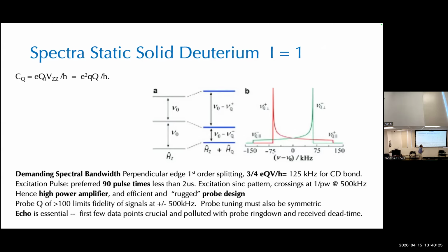Yeah, so this is the most probable orientation, and I was happy to see Anish reviewed this in his problem session, and then the other instructors have also talked about it. So the most probable orientation is to be perpendicular to the field, and that is this big feature here. And the least probable is to be parallel to the field, and that's the so-called shoulders and horns. Shoulders being parallel, horns being perpendicular.